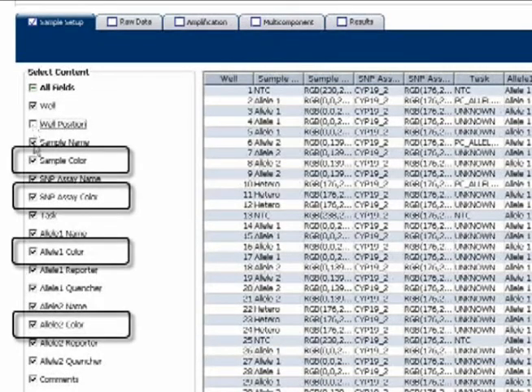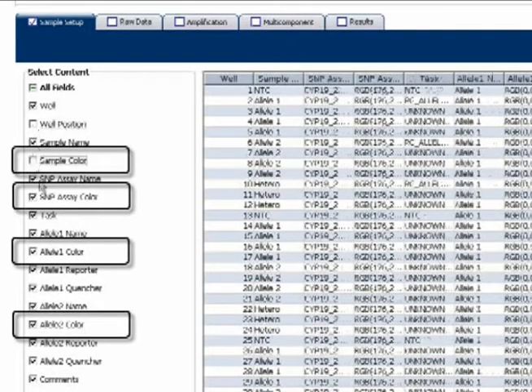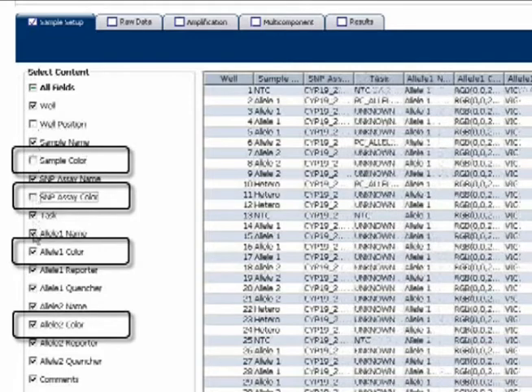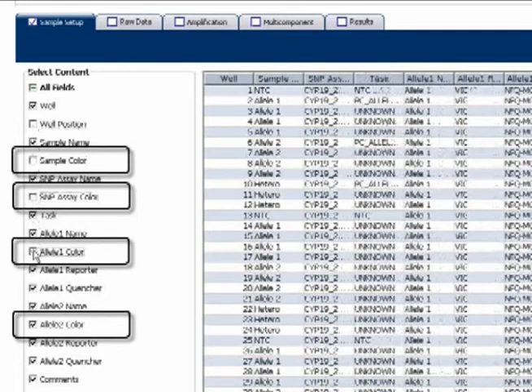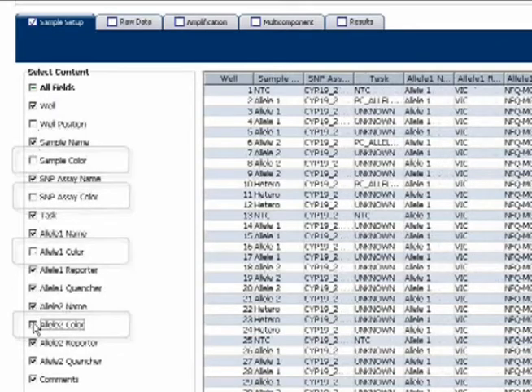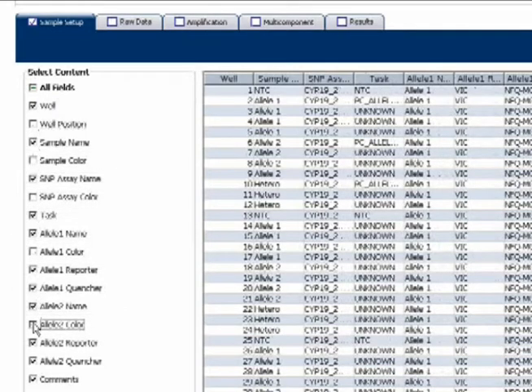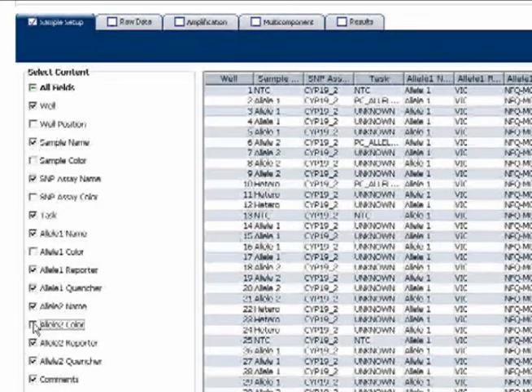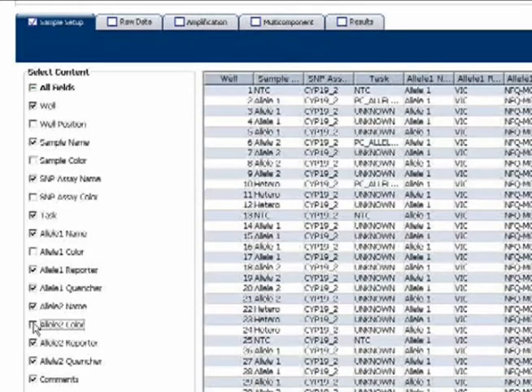Also, just for convenience sake, go ahead and uncheck all four columns that contain the word color. It's a lot easier to select colors manually in the VS7 software later than it is to figure out which individual red, green, and blue values look good.